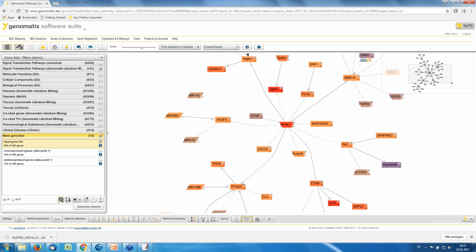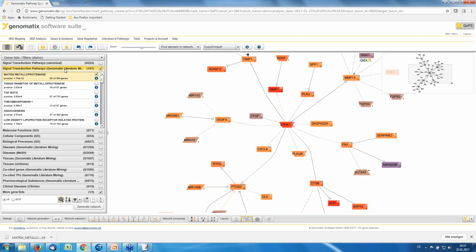Okay, the last two things are network extension with transcription factors and adding connecting G nodes to a network. I'll show you this at the hand of another network, namely the mothers against DPP homolog, so SMAD pathway actually.